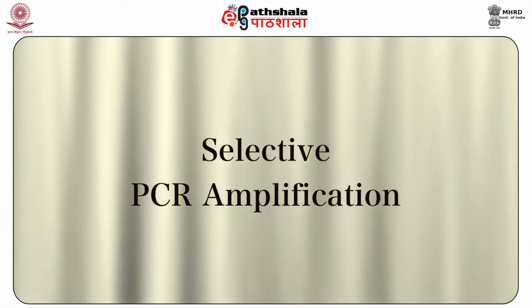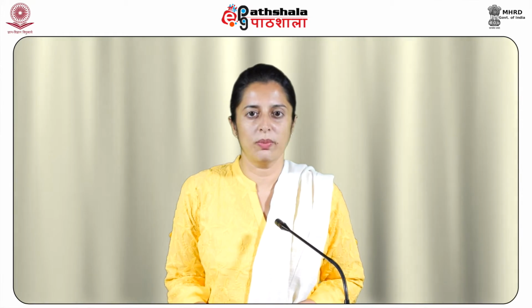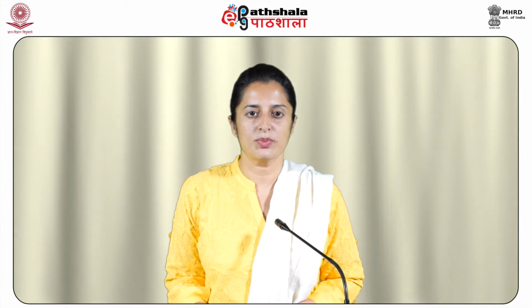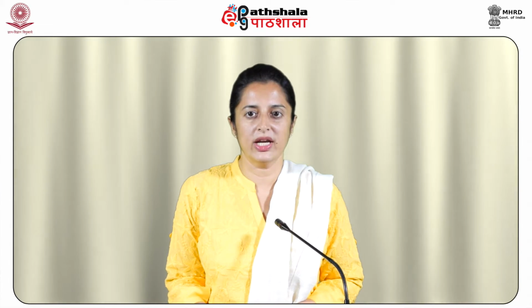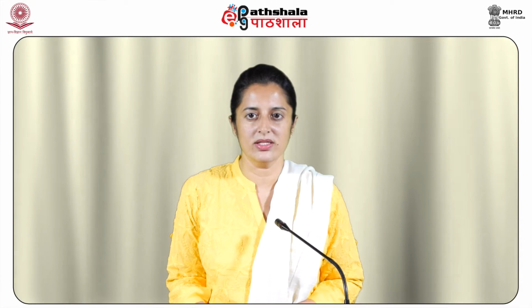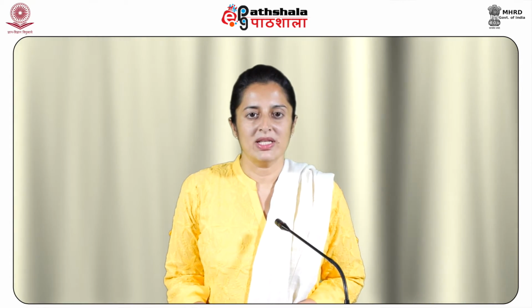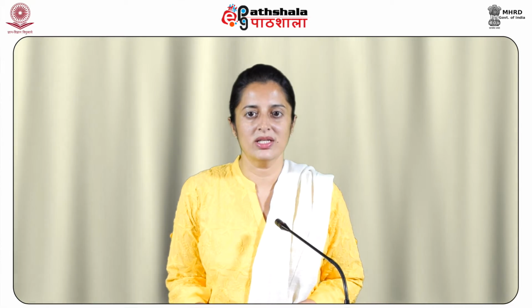Step 3. Selective PCR amplification. After ligating the genomic DNA fragments with their corresponding adapters, researchers are left with a series of DNA fragments that consist of the specific MseI adapter associated sequence, the destroyed MseI site, a genomic DNA fragment, the destroyed EcoRI site, and the specific EcoRI adapter associated sequence.